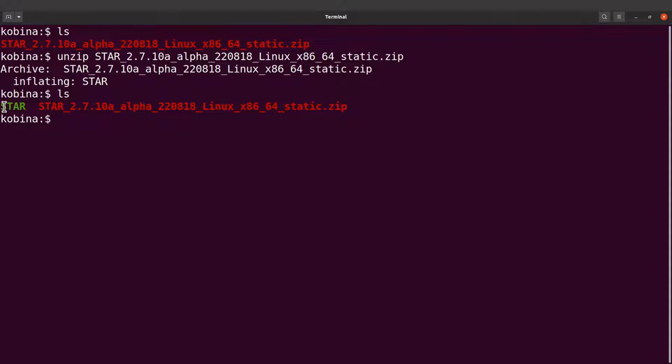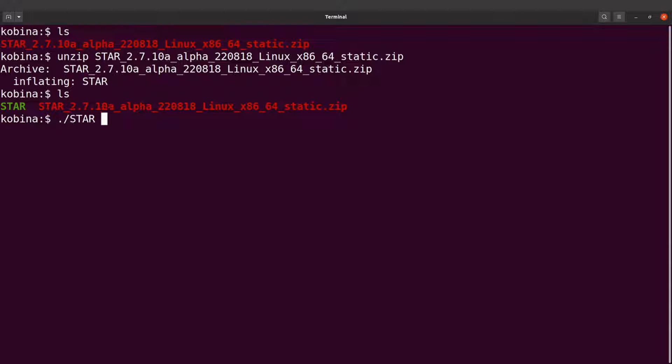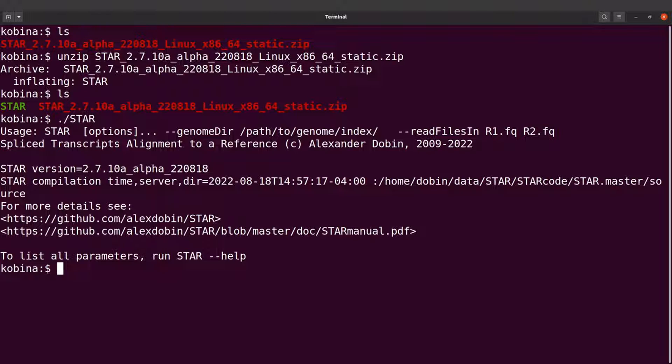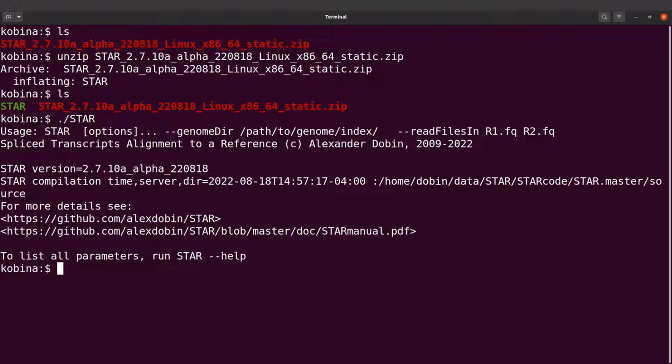So that is the executable. I repeat, this is the executable. So now I can run this. I can say dot slash STAR, then I can use that to run some STAR commands. So that's how we do it. That's the STAR binary or the STAR executable.